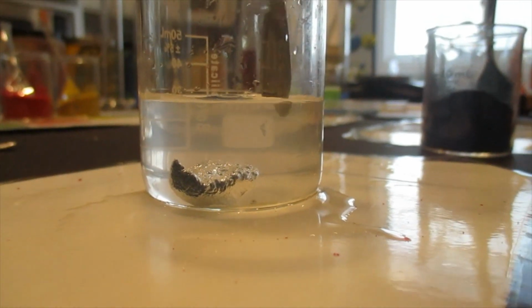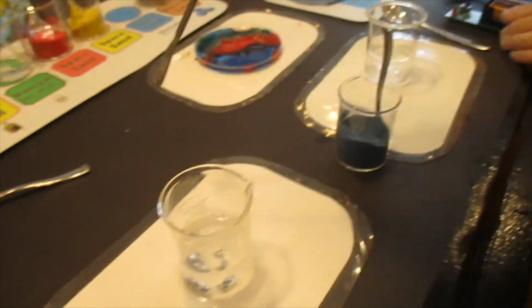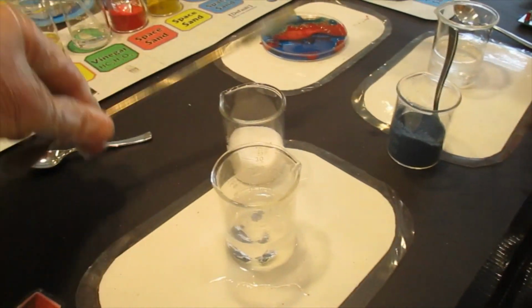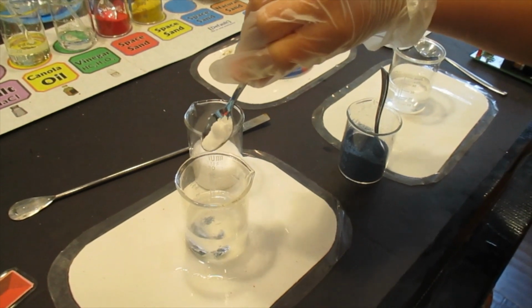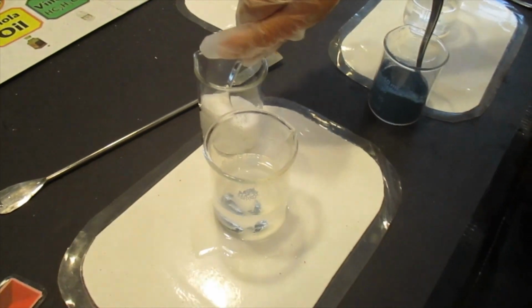Okay, so now we're going to add more salt to this one, Ian. Add another scoop of salt. Oh, we do need the spoon again, actually. Add another scoop of salt to that same beaker and stir it in. Even more than that. That's not enough. A little more.